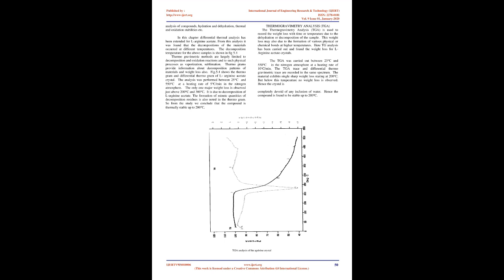Here two important methods were adopted for the analysis of the given samples. They are: 1. Differential thermal analysis, DTA. 2. Thermogravimetric analysis, TGA. Differential thermal analysis, DTA. Differential thermal analysis has been extensively applied for qualitative and quantitative analysis of chemical compounds. This analysis found the existence of various phases, which in turn led to the essential studies of the formation of solid solutions. Using this technique we can record the temperature difference between a substance and a reference, when they were subjected to an identical cooling and heating process at a controlled rate. This recorded output is known as the DTA curve, and if the substance is thermally active, this will show a series of peaks whose positions are determined by its composition.